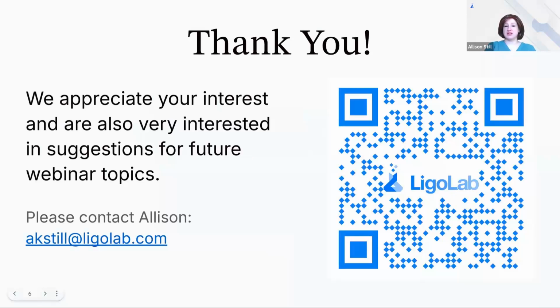Site security was one advantage. The other LIS we worked with didn't have any kind of that, right? If you were a multi-facility lab, the cases at lab A, there'd be no difference between them and the cases at lab B. And so it'd be confusing to the lab techs, like which cases are here in my lab. But LigoLab has a nice solution for that.